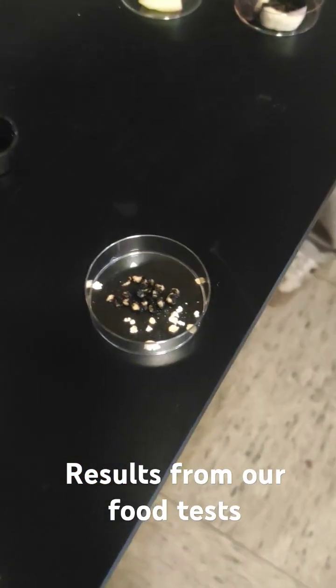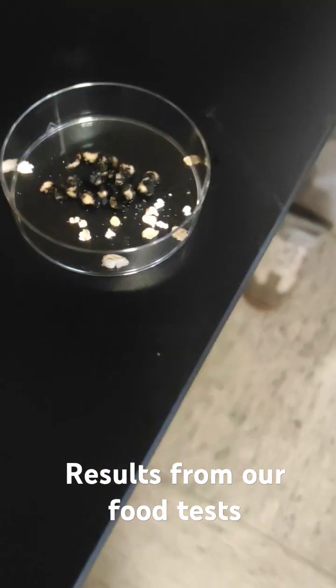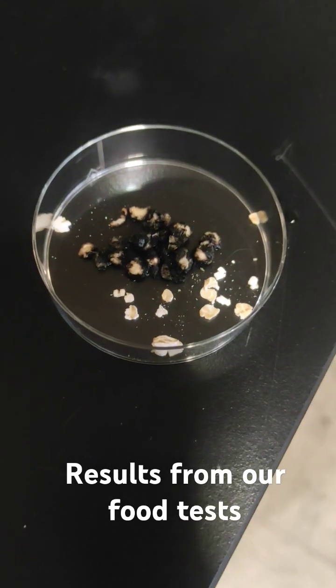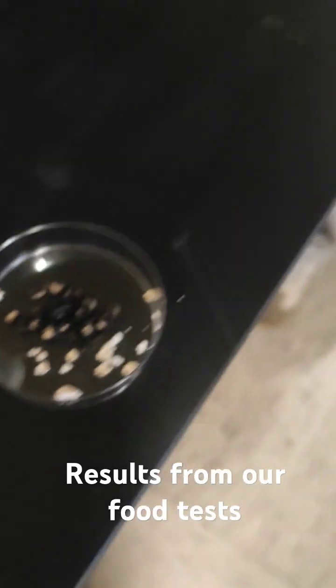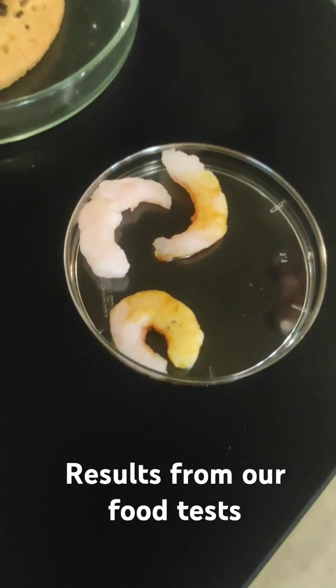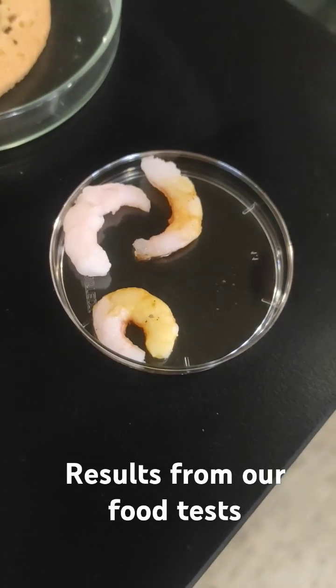First we have our test for starch, the iodine test. If it turns black like we see in the oatmeal, there's plenty of starch. If we're here at the shrimp, it's brown, we have less starch.